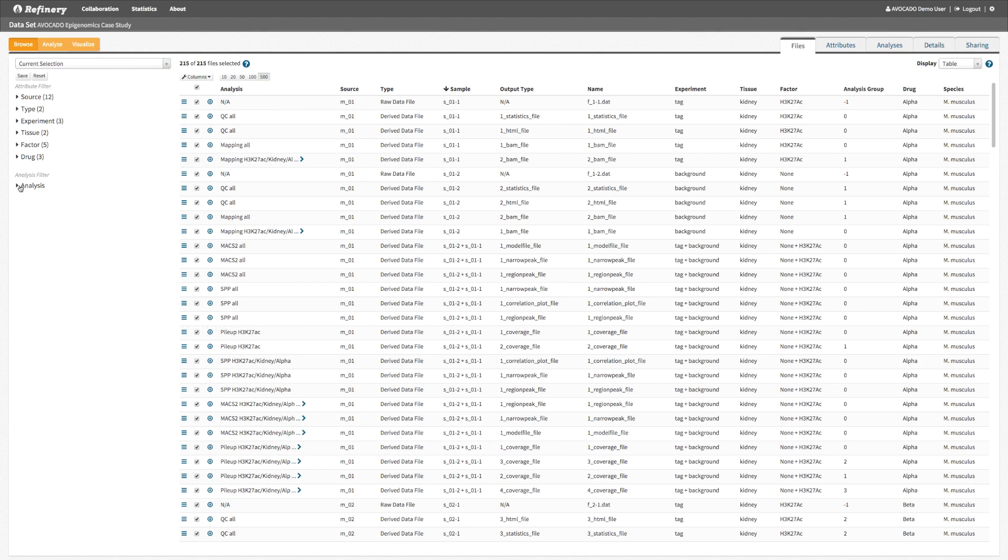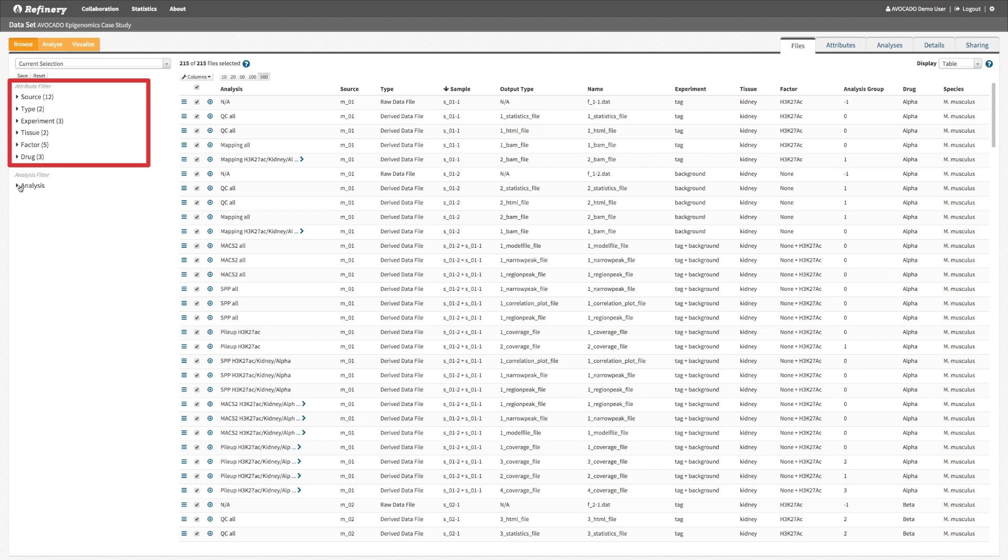This is the Refinery dataset browser. The demo dataset shown here contains 215 files, which are annotated with metadata attributes such as tissue origin.